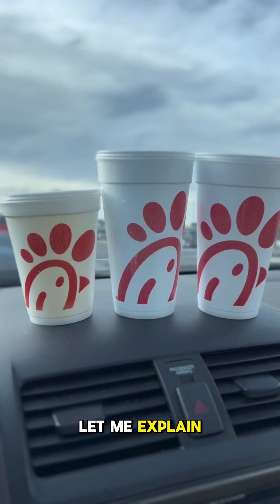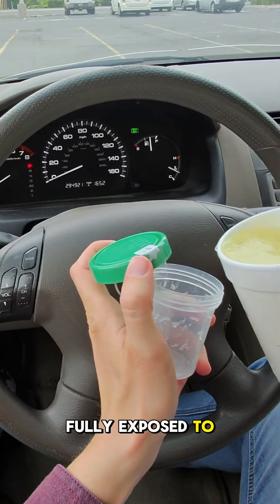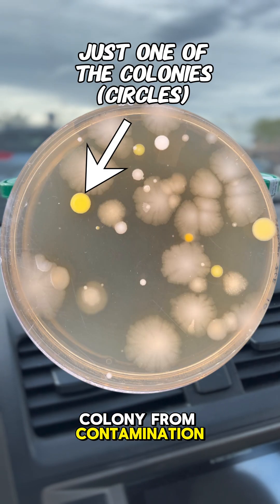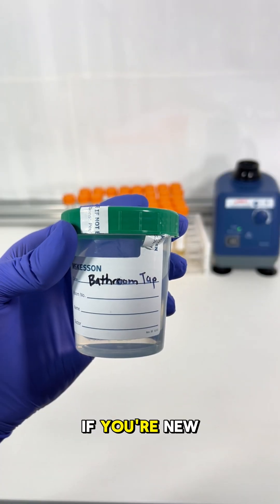The amount of contamination that shows up depends on how much interaction the water and ice had with contaminants. For example, with the car contamination, while I was transferring containers the liquids were fully exposed to the car air for about three seconds — with that amount of exposure, I'd be surprised if there was more than one colony from contamination. But to see any growth, we need to take this to the lab.